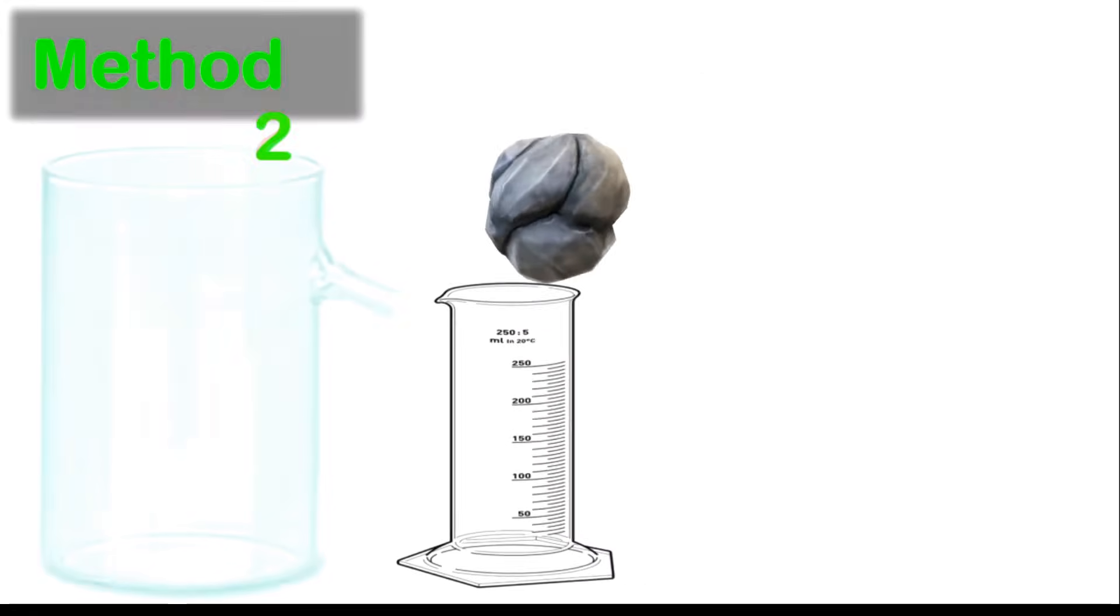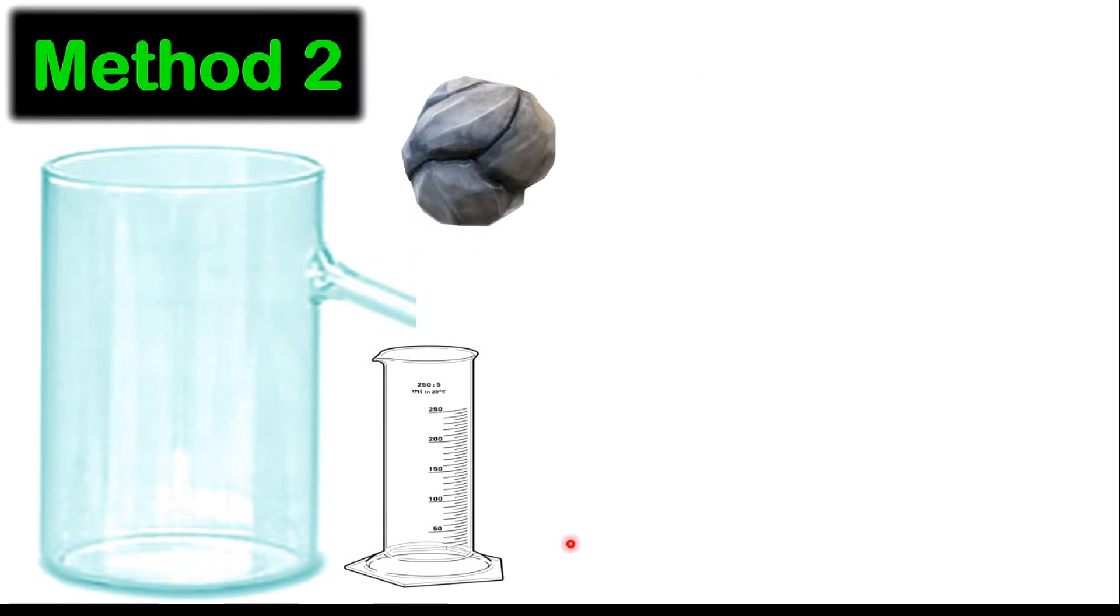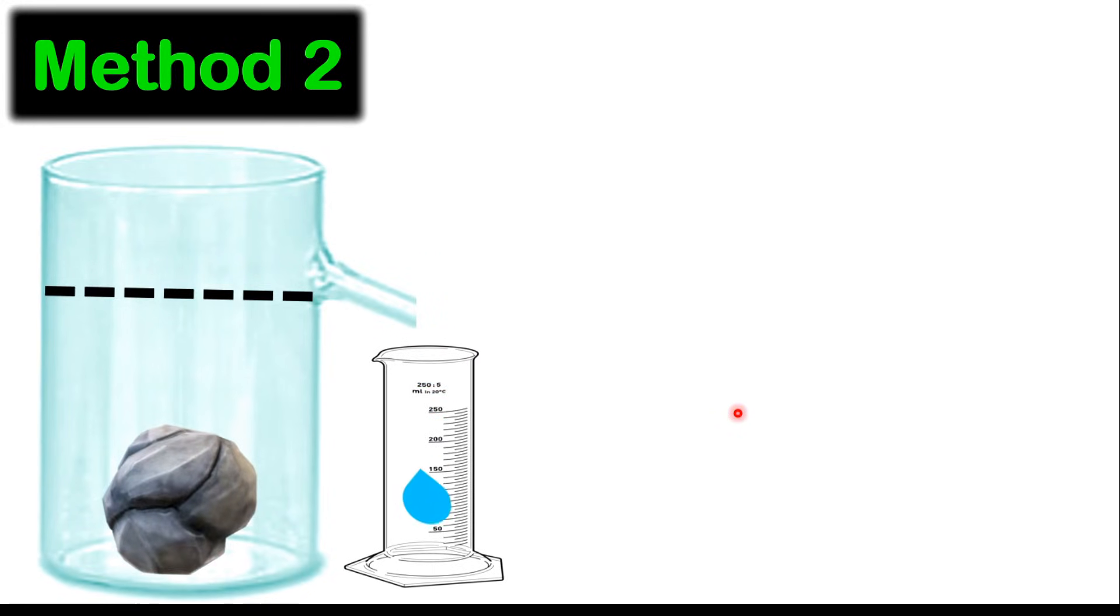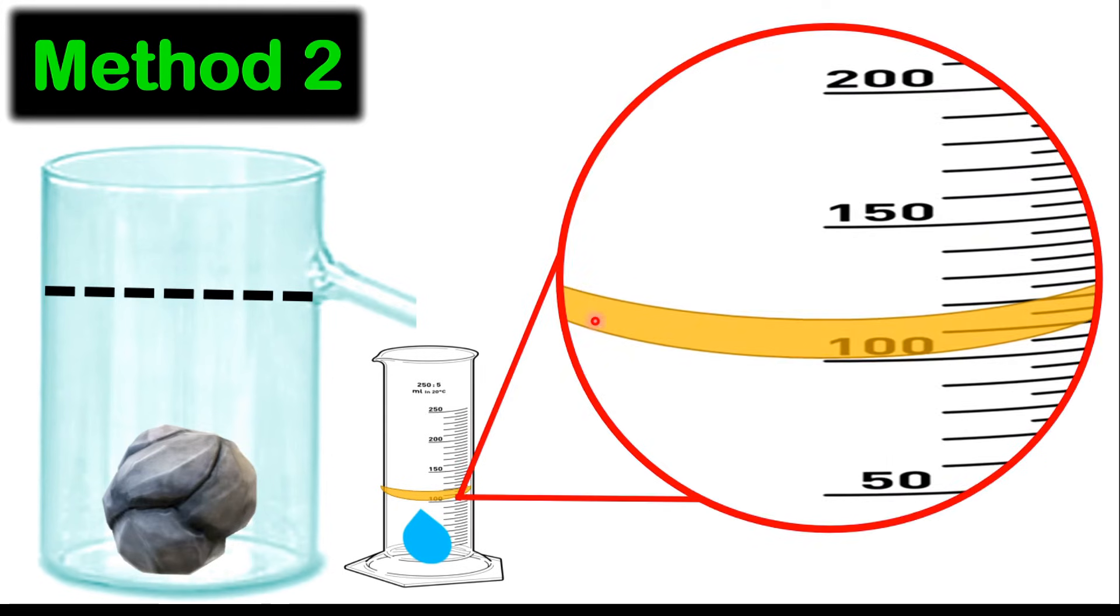Method two uses a displacement can or what we call a Eureka can. First, pour liquid into this can to make sure the liquid will be at a level where all the liquid will start running out and then stop. After that, place your measuring cylinder next to that can. Then insert your object. Notice once you insert the object, liquid will start to flow out of that can. Once the liquid has flown out, you can measure the volume. There will be a meniscus, so you're going to read that meniscus. For example, this meniscus may fall on the 100 mL mark. This means the liquid in the measuring cylinder has a volume of 100 mL. Because the irregular-shaped object will displace the same volume of water.